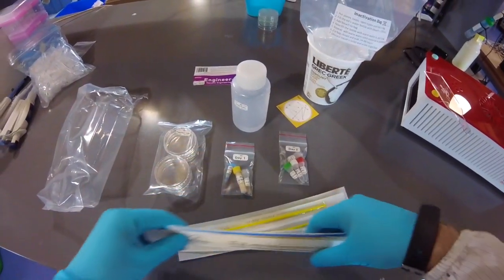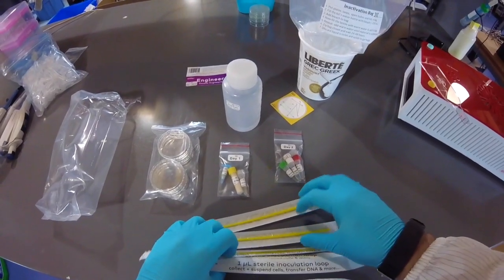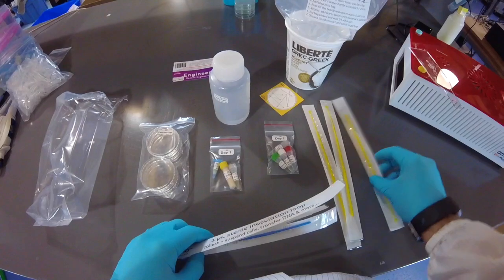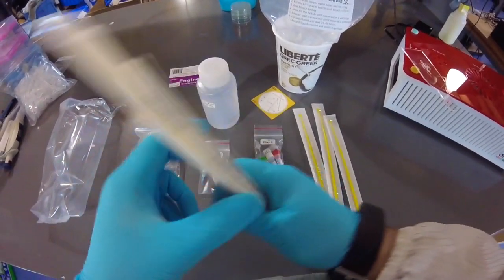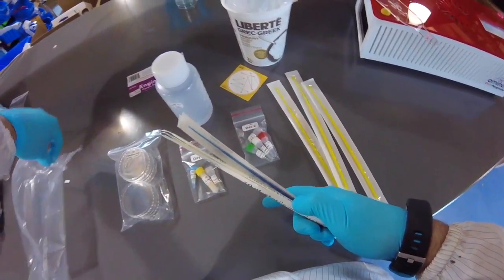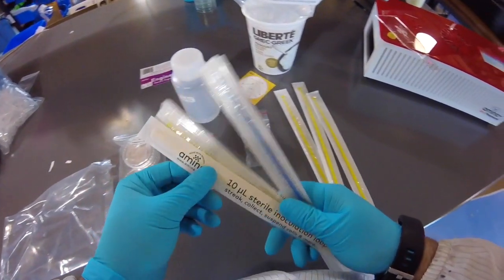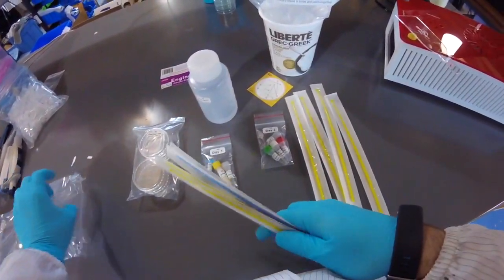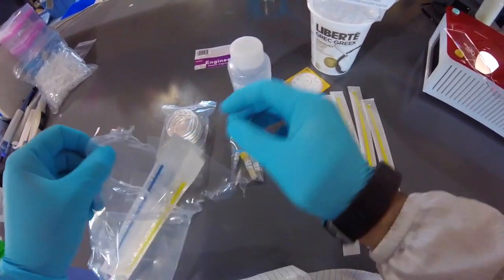Okay, today we're going to be using some of the yellow loops, but in the future days we're going to be using some of the blue ones. So in fact, today we're going to be using 3 yellow loops. Actually, we're going to be using 4 today. Okay, I'm going to put the rest back.